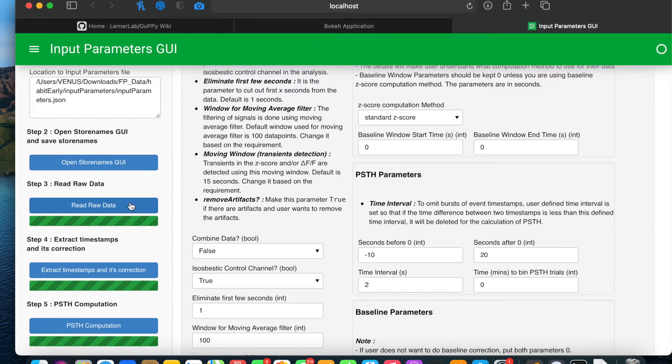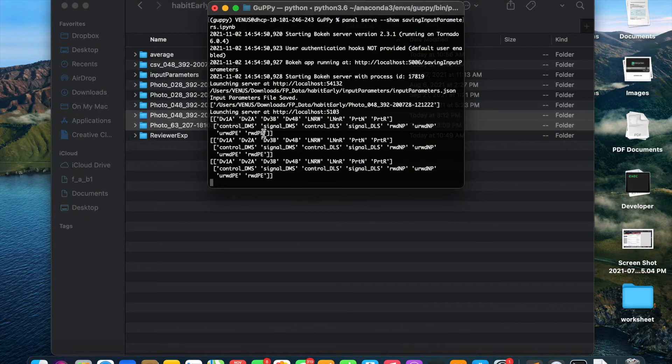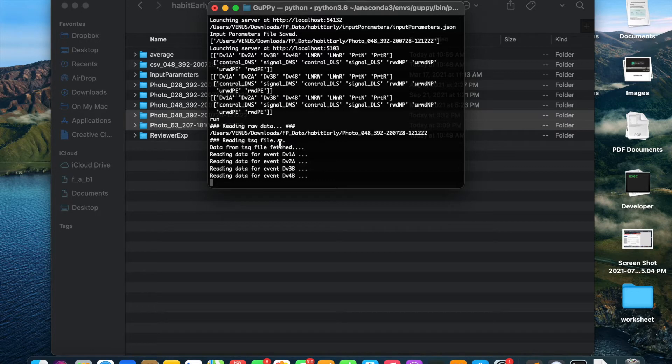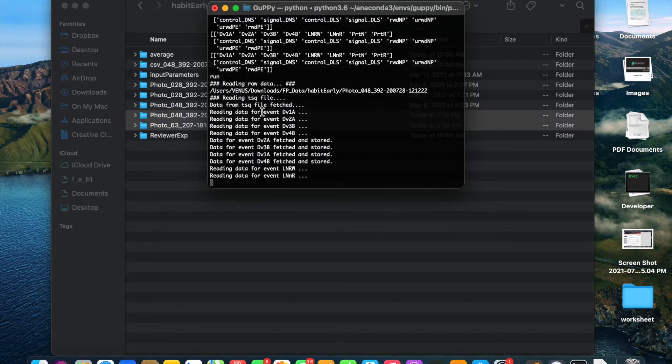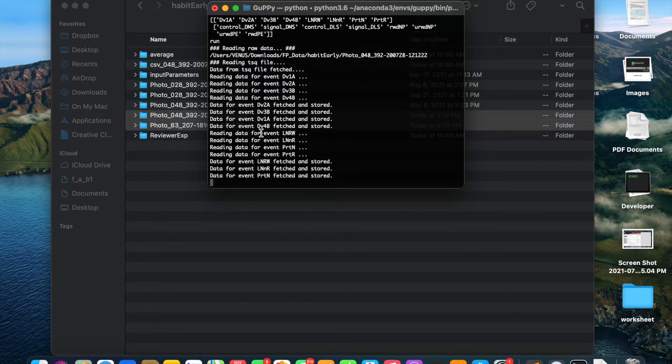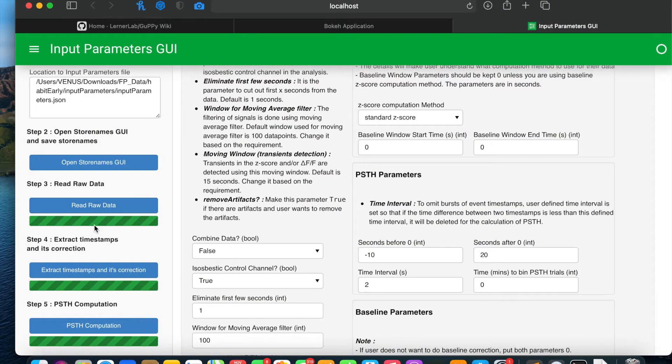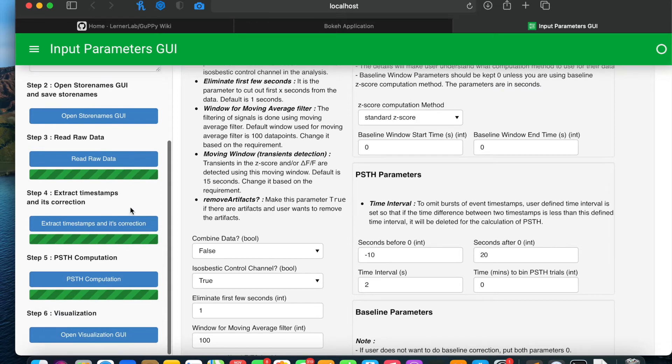I will do the third step which is reading of the raw data. You will see in the terminal this step happening. If there are any errors, you will find the errors on the terminal. After the data is fetched, you will see that this green bar will stop moving.